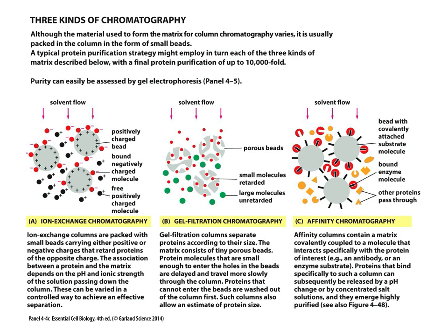You then could add a solution that would maybe change the pH, and that would allow for these negatively charged molecules to be released by those beads, and then they would move into it. So you would switch to your test tubes before you added your solution.